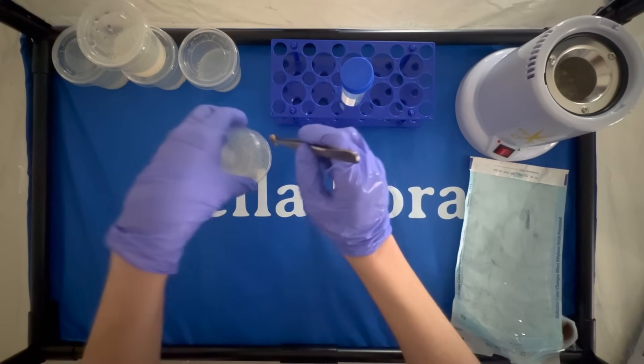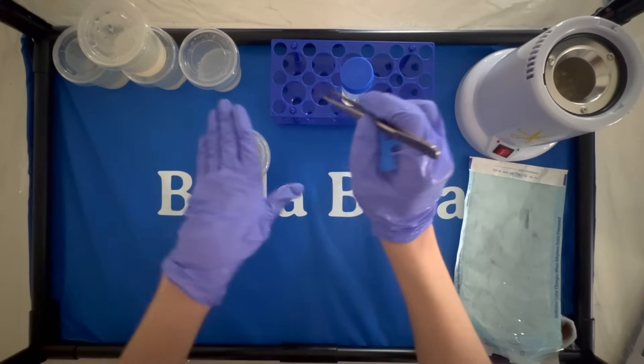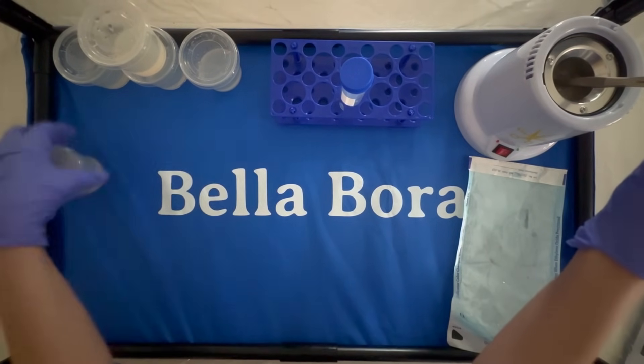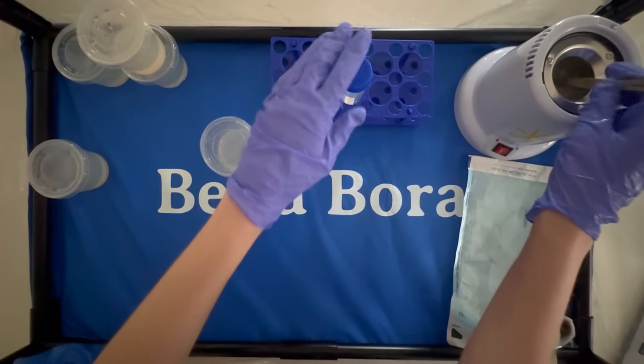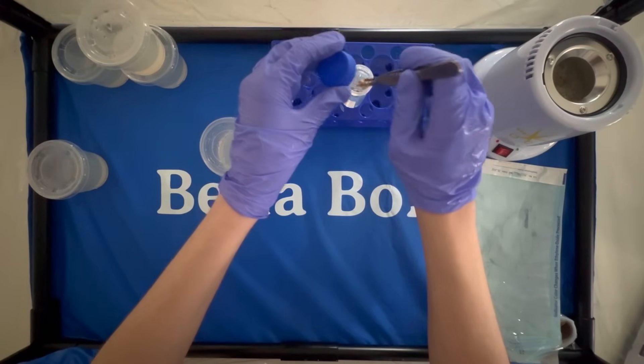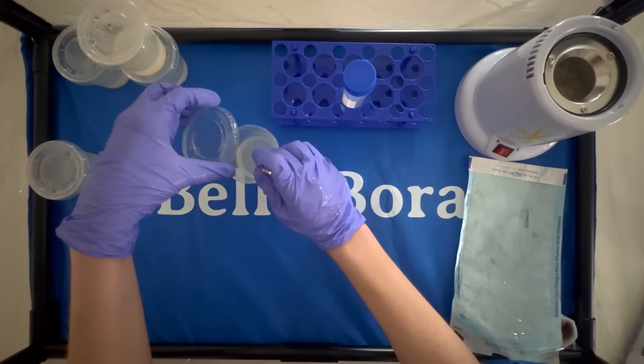When we're working inside of the still air box, you don't just want to leave the lids off of things. You can do that if you're in a laminar flow hood, but the still air box is not as good at preventing contamination. It just sort of prevents the air from moving as much as it would if you were just doing this anywhere. So we want to move quickly and avoid moving our arms unnecessarily inside of the box.